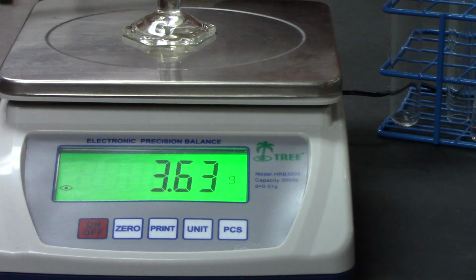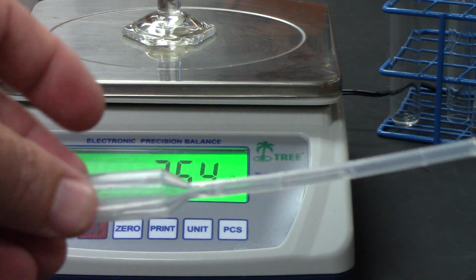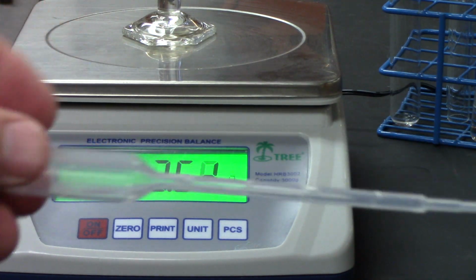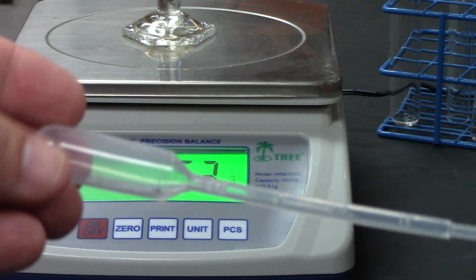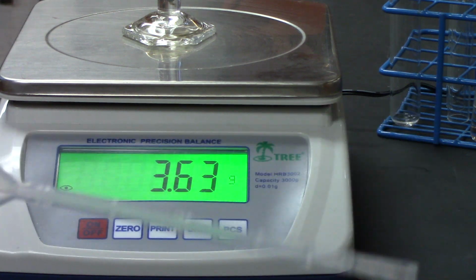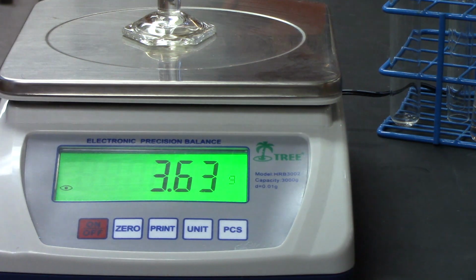Oh, by the way, this thing here is called a transfer pipette. It's plastic. They're real simple to use when you need to transfer one liquid from one place to another, and you can just throw it out when you're done. Okay, or you can keep it and use it for later on. But they're really handy.